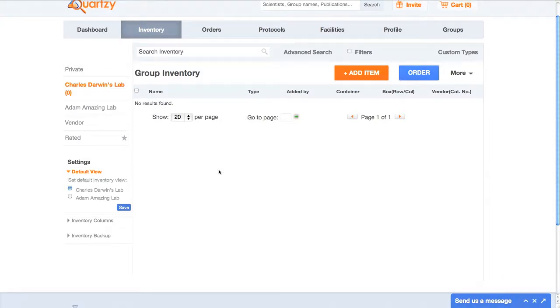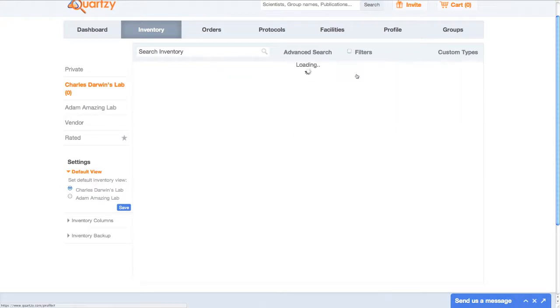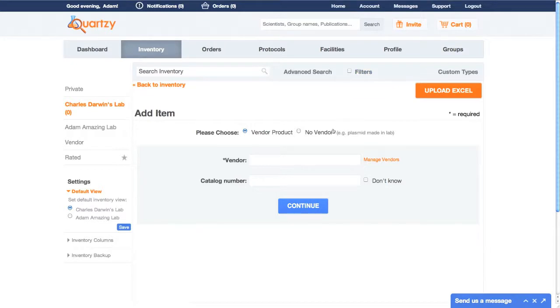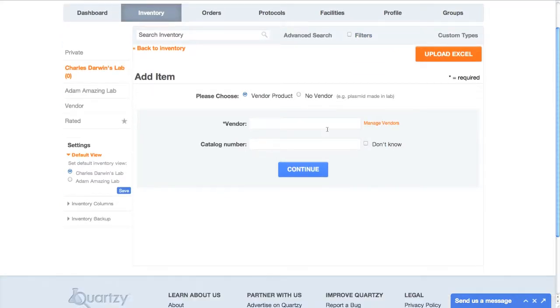To start adding, click the giant orange Add Item button. There are three ways that Quartsy makes it easy to populate your inventory.